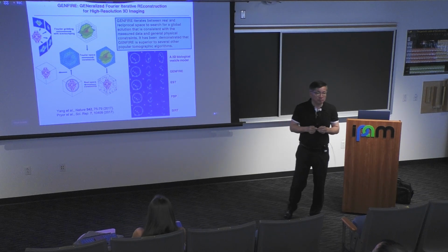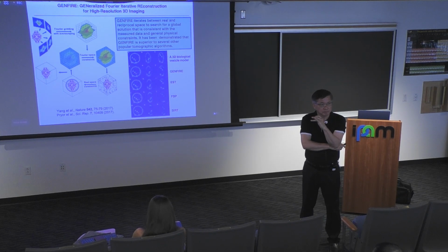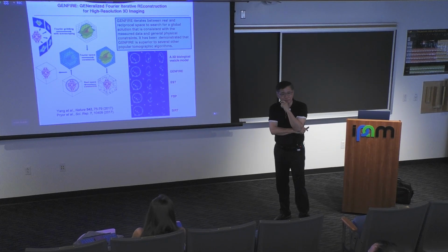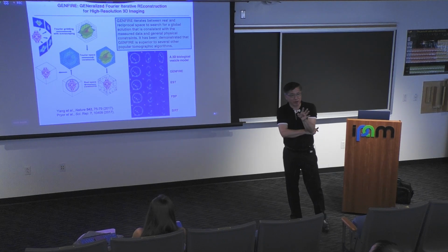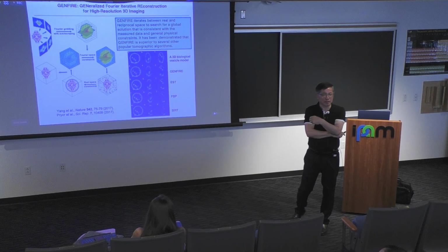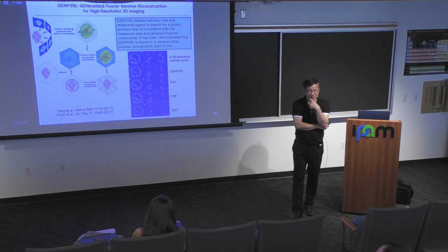Because we do it for holographic techniques, but has anybody ever tried to create a deep learning model that would directly infer the three-dimensional structure from the set of rotated raw data frames? That's very good. Nobody, to my knowledge, maybe people are working on it, has got results close to the iterative algorithm. Right here on this campus, I think the lab of Aydogan Ozcan has some work in reconstruction of images, but in the case of digital holography.